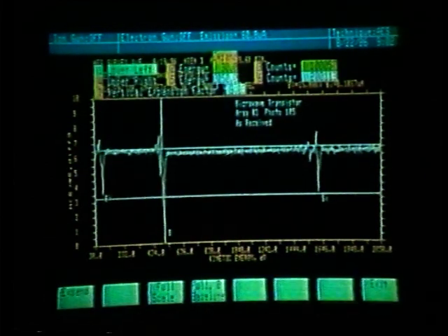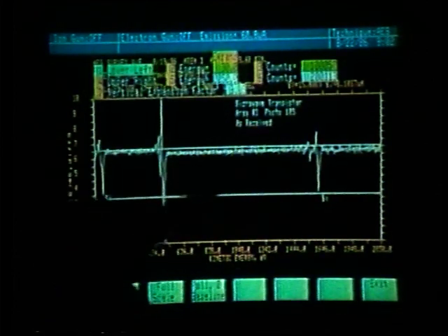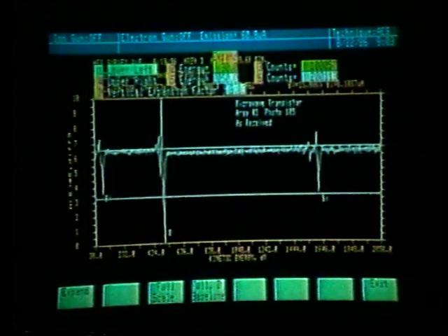When we press the expand key, we see that we have a rectangle superimposed on top of our data. Looking at function key number 1 at the top, we see that we can control the lower portion of the rectangle and the left portion of the rectangle. Function key number 4 will allow us to control the upper portion and the right portion.